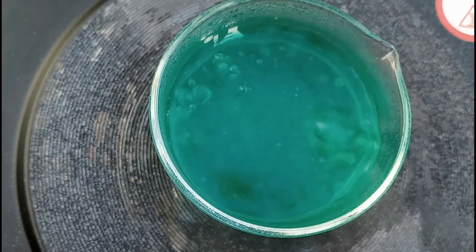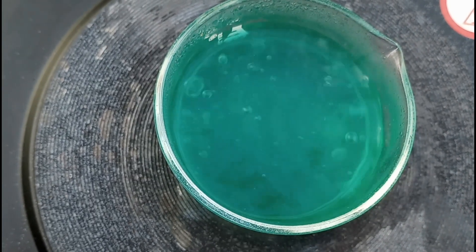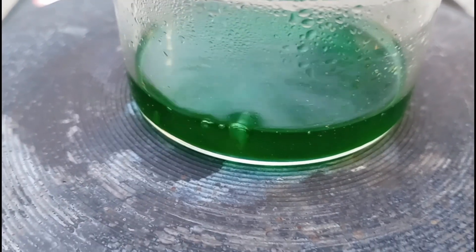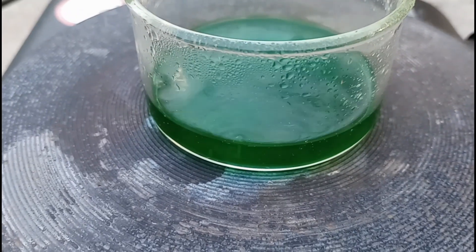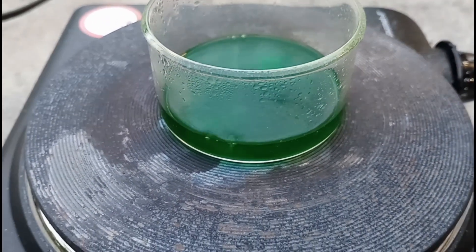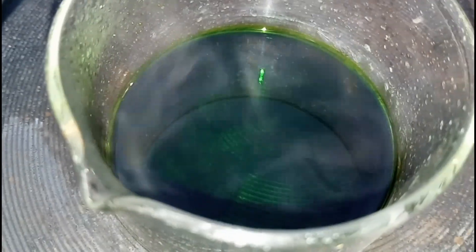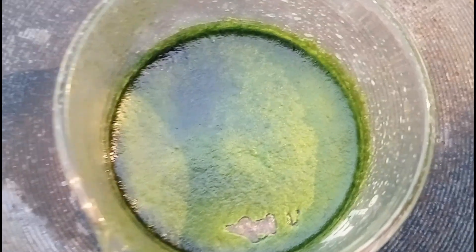As it started to reduce, it started to become a more pronounced green color, instead of the lighter blue color. Now it's almost dry, and here it's starting to crystallize.